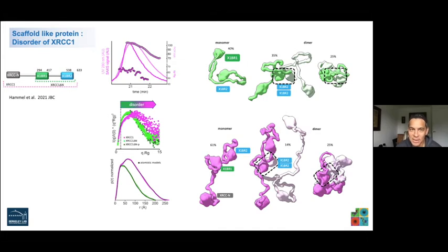Yeah, Alim. I do have a comment on this. Go ahead. Thank you. So there are two things to think about here when it comes to SAXS and the size of things. One is that a beamline like SIBYLS has a fixed camera length. They have a maximum size that they can effectively measure, so you want to make sure you're within the range of the camera. Otherwise, you need to find a facility that can change the camera length. So you have to ask Greg about whatever that is right now. I would comment on that as well.